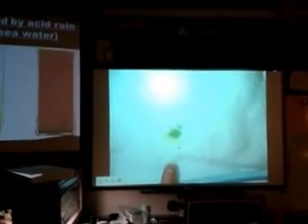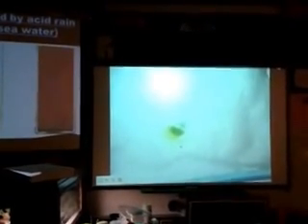Imagine this is what happens downtown, in industrial areas where people are breathing this stuff. Look closely. If you want to come closer, look at what happens to the copper. It is now corroding. The copper is corroding, and remember we learned about copper ions? Copper ions are blue in color. You see blues trying to form?